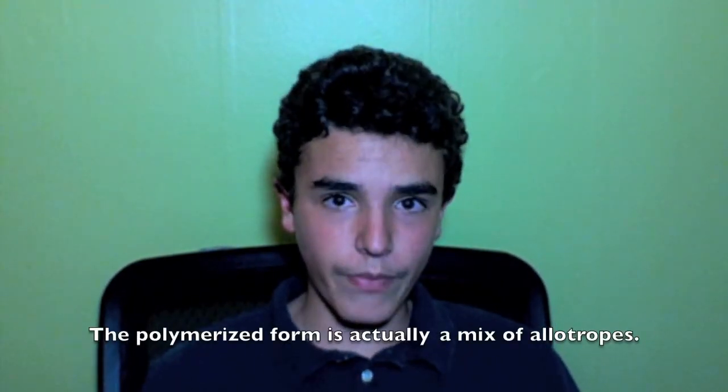So sulfur itself is usually found as a yellowish powder, but it has many allotropes, or different forms of the pure element. In an experiment I'm going to show you, I actually convert the powder form into a polymerized form. Sulfur has a very beautiful blue emission spectrum when it burns, so I'll also show you that.